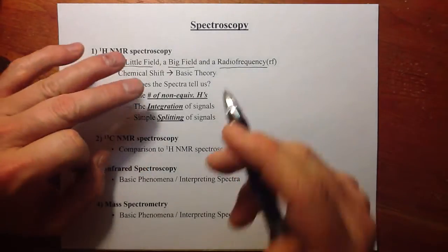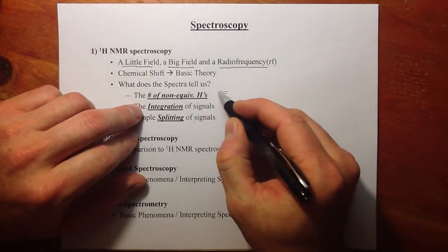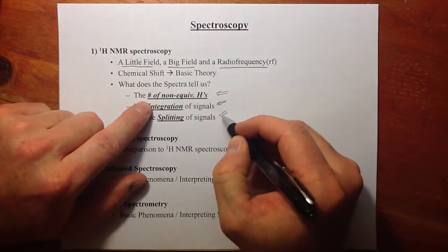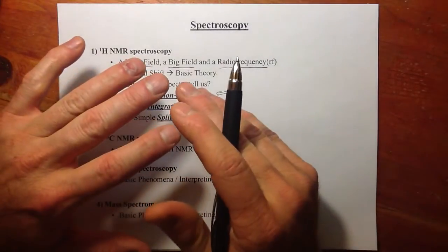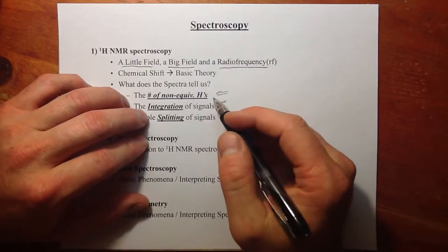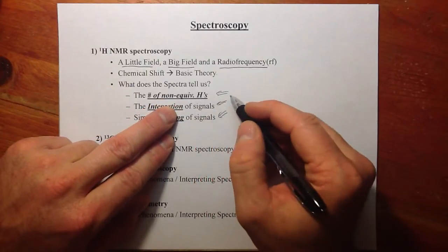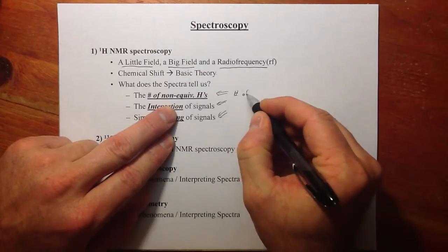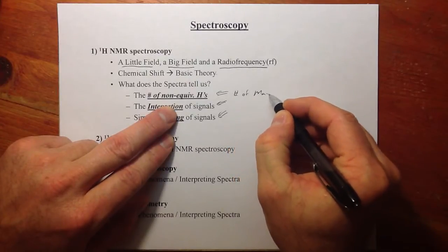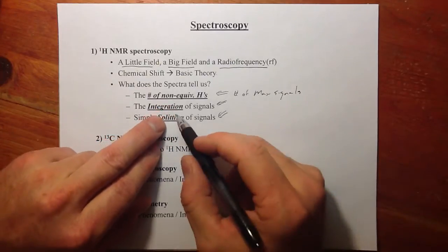In the next 3 videos after this, we're going to focus on that data, where we look at 3 parts of the data that have to be pulled out when looking at structure, 3 bits of data that have to be put in. We need to know the number of non-equivalent protons, because this will give us the maximum number of signals in the spectra.